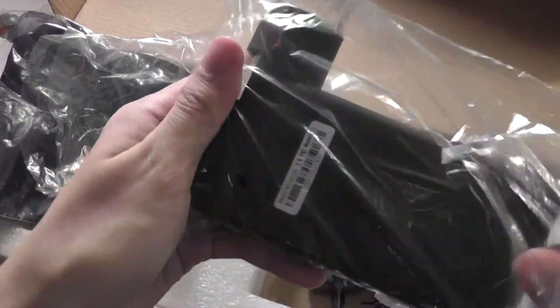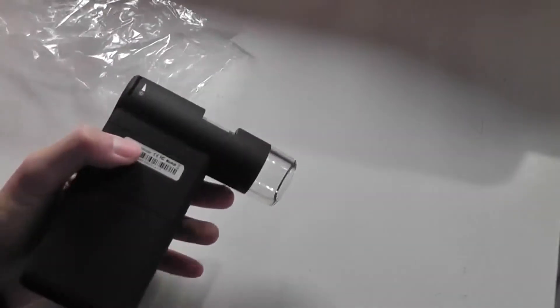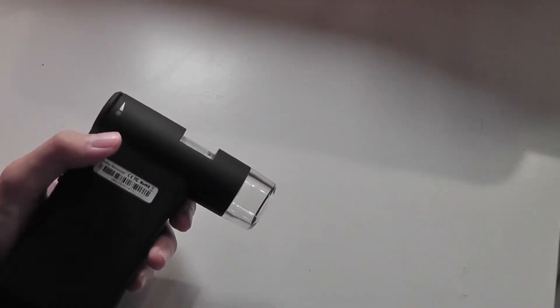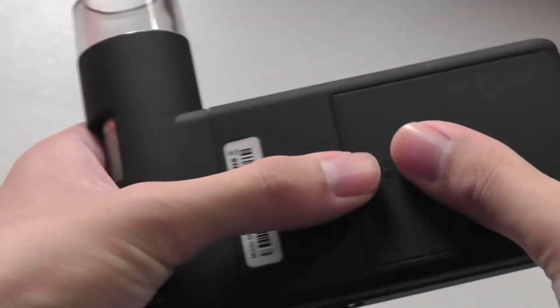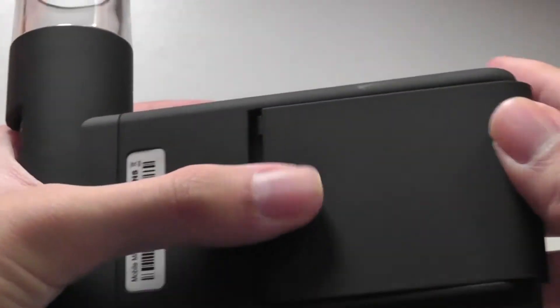Taking a look at the actual design of the device itself, we can see that the actual microscope is made out of a soft touch material that's pretty nice and comfortable to use. We insert the battery on the inside and the device will power on when the lid is opened.